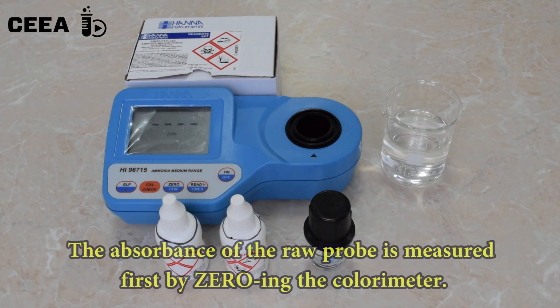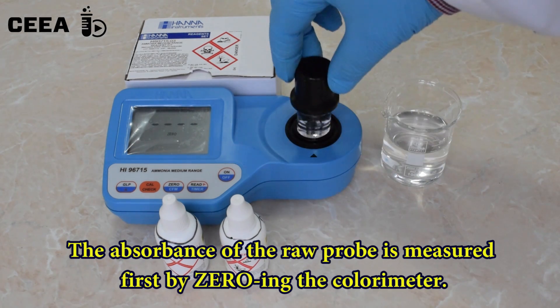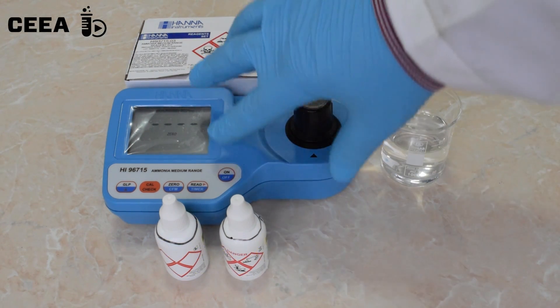First, the absorbance of the raw sample is measured, calibrating the photometer.